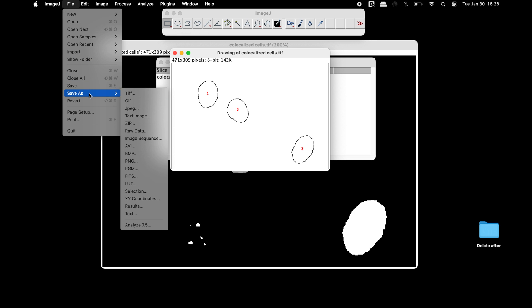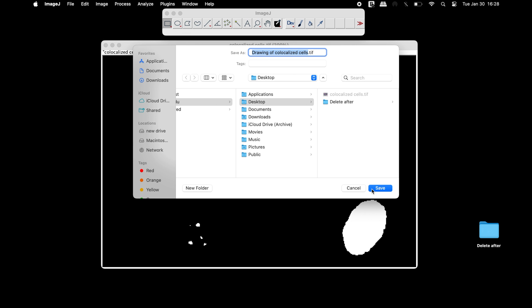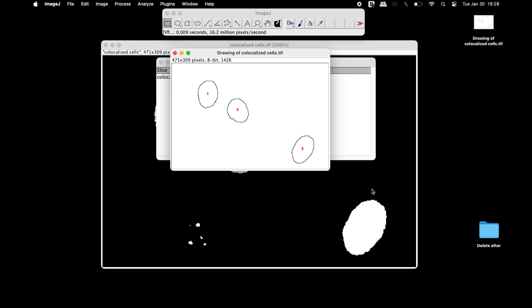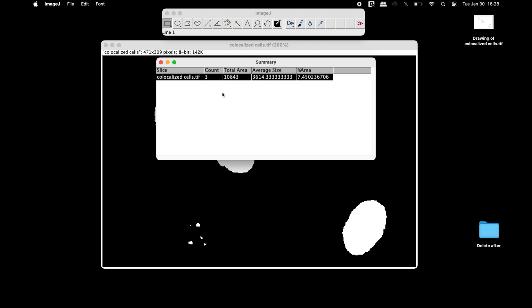This image can be saved in any format of your choice if needed. In the summary window, users can find the total count of the co-stained cells, or double staining cells.